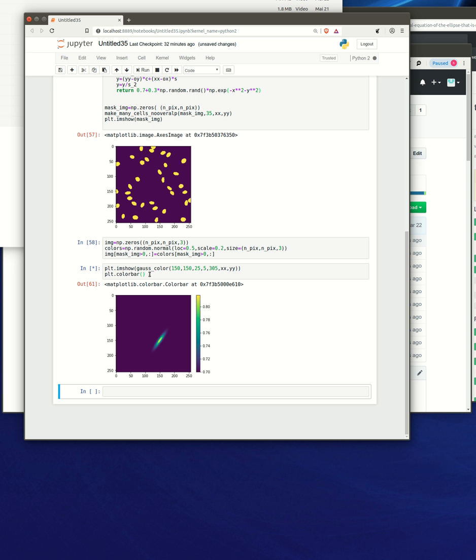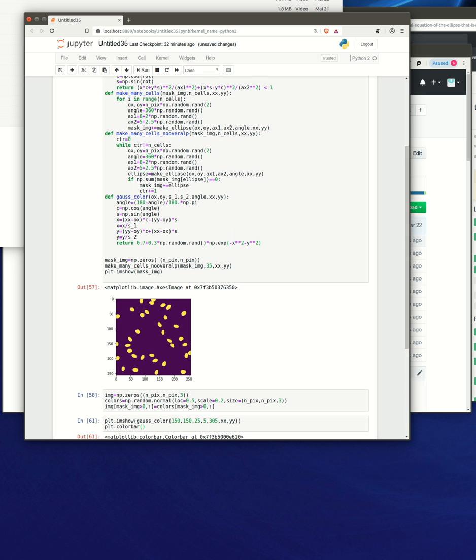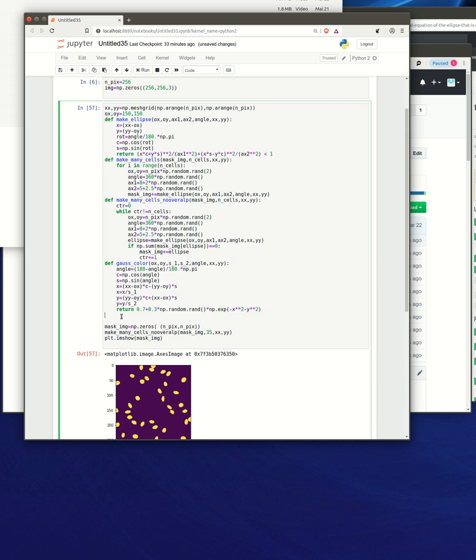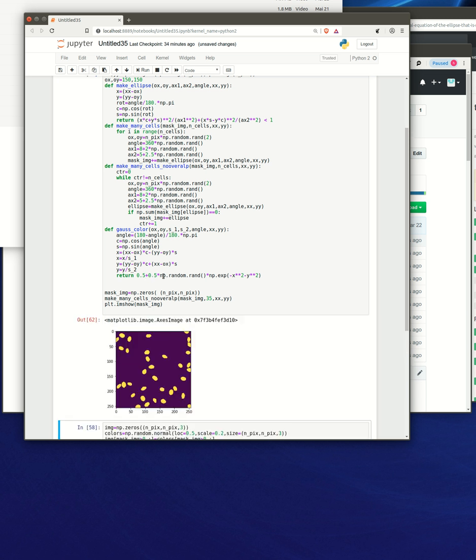Okay, so we have these variable colors, and let's see how it looks if we make cells to be the same color. So these numbers can change, of course. What you can see in the supplementary information of our paper is that it is important to have some level of variation. It shouldn't be always constant, otherwise the generator always produces the same images, and we want to maximize the versatility of the shapes it can produce, so there has to be some kind of randomness inside the cells.